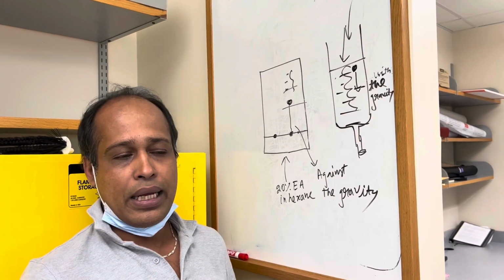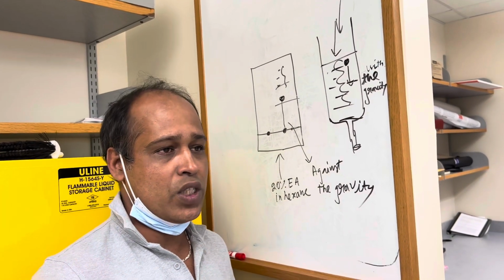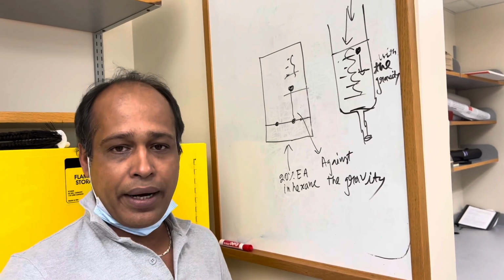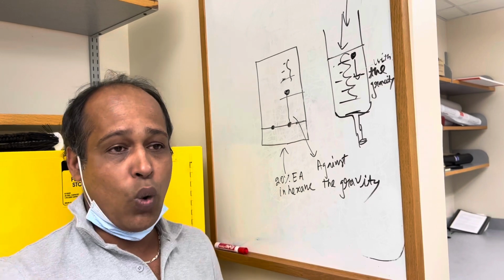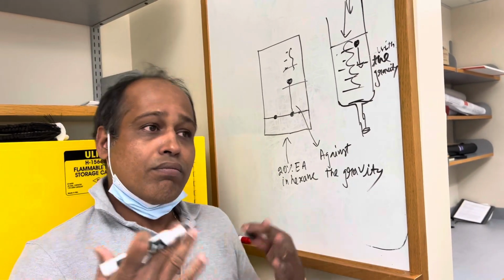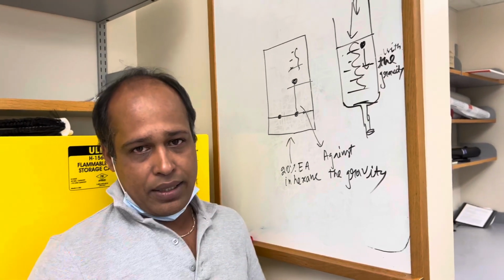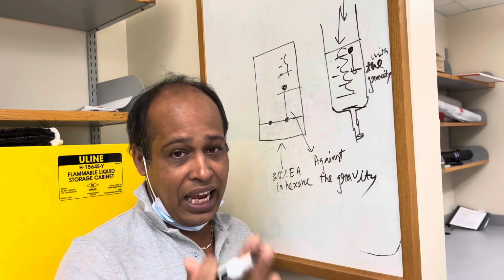But another thing you have to remember: in your compound, what are the functional groups there? Is it getting changed with the silica gel? If it is, why? What kind of precaution can you take? As far as I know, you have an amine type compound, a secondary NH.